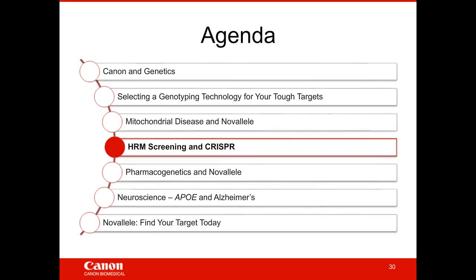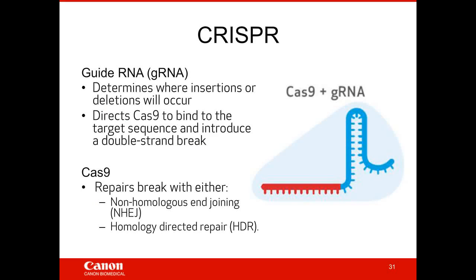The second application I would like to discuss is related to CRISPR, more specifically using HRM to screen CRISPR-derived edits. I'm sure we can all agree that CRISPR is a pretty hot topic.